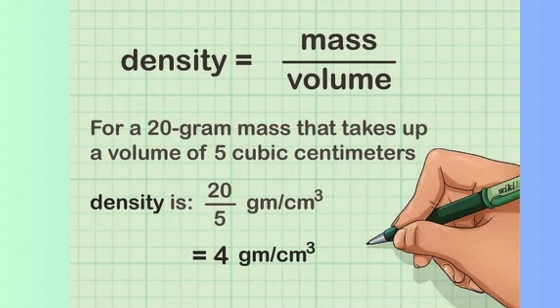That's it for today's video. Measuring the density of solvents may seem simple, but it's a fundamental skill in pharmaceuticals.